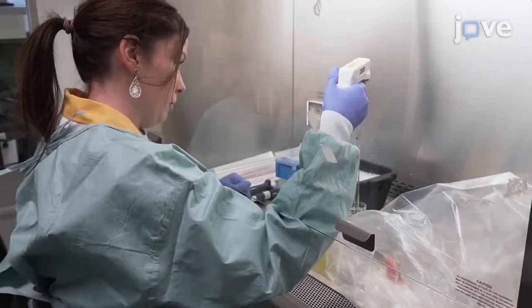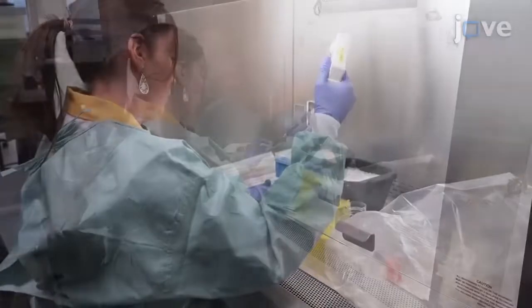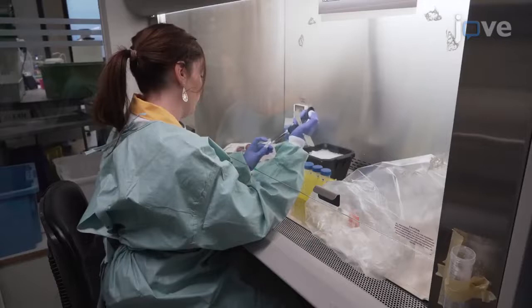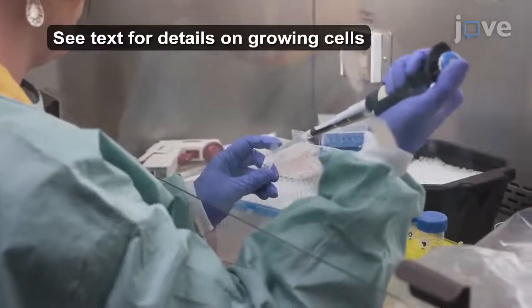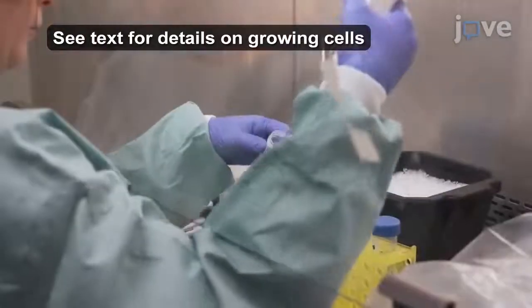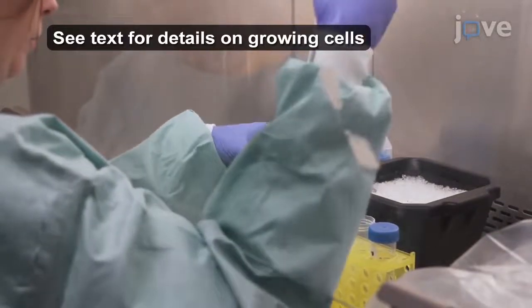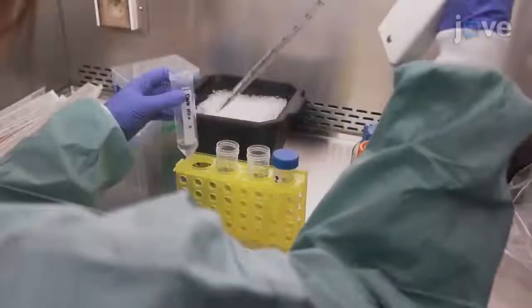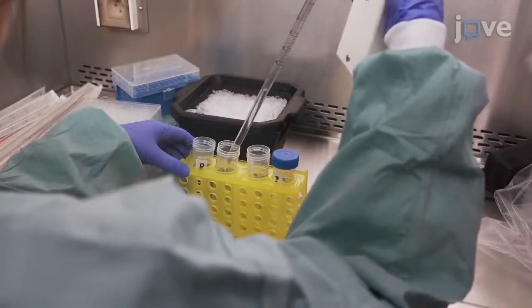After growing the HEK cells, mix 360 micrograms of helper plasmid, 180 micrograms of plasmid encoding the vector capsid, and 180 micrograms of plasmid containing the transgene in 18 milliliters of 150 millimolar sodium chloride to prepare the DNA mix. Distribute this mix over 3 50 milliliter conical tubes.